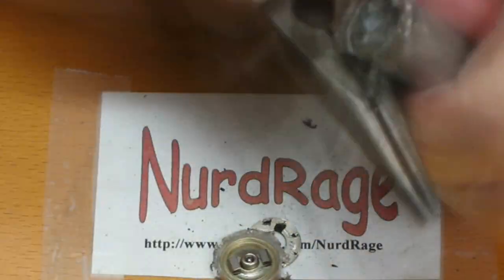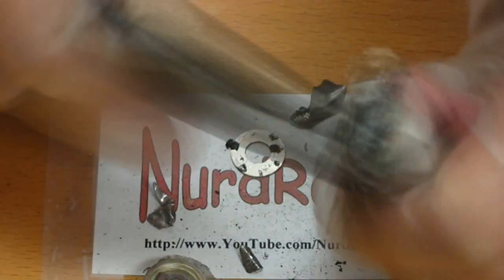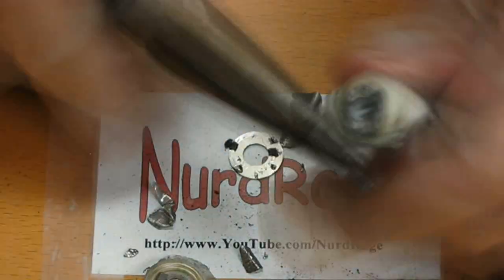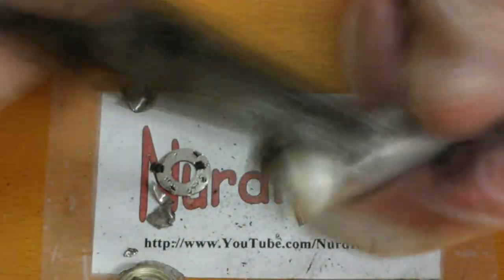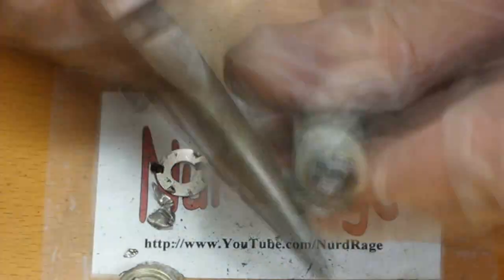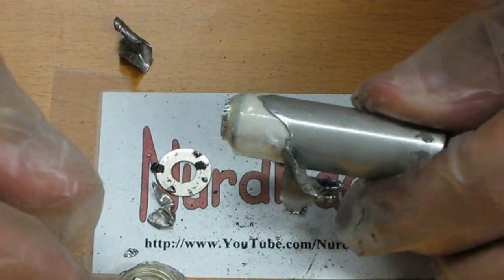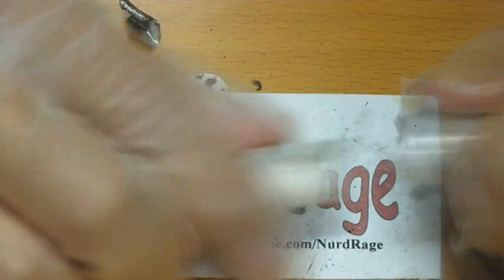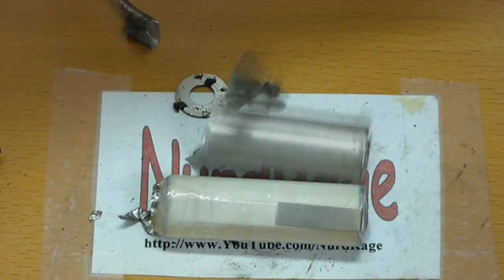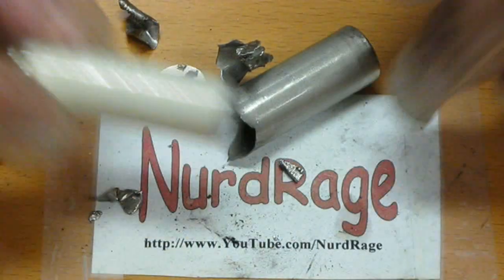Now we've exposed the core of the battery. Continue peeling and ripping away the casing to get at the top of the battery. This little thing is built like a fortress so expect some frustrating manual labor to peel the casing. Be patient and don't let the casing touch the exposed top of the core or the battery will short out. Finally we've peeled away all the upper casing — now just pull out the core. I'm going to go over to the fume hood to do the rest of the video since this core is where all the chemicals are.